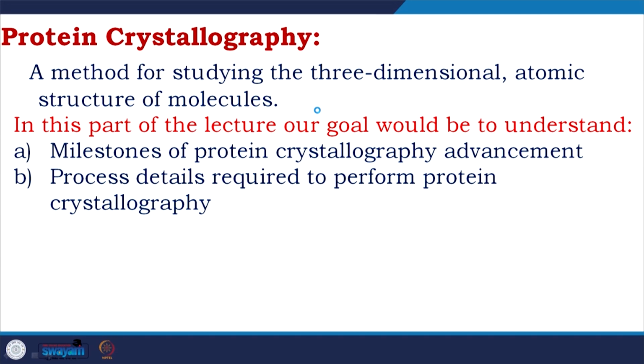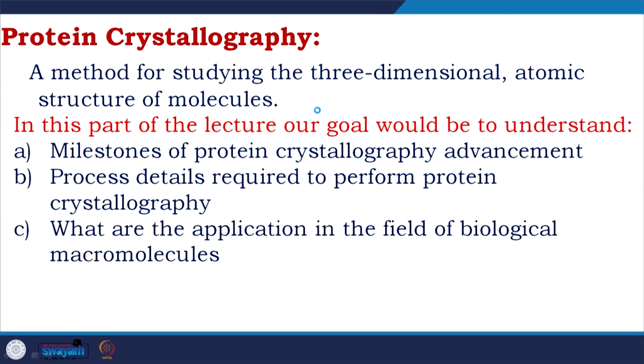So, new generation listeners, if you have higher ambition, this could be your technique. We will talk about the process details required to perform protein crystallography. So, the process, how it is happening, and every technique in structural biology is related to how to purify the macromolecule.